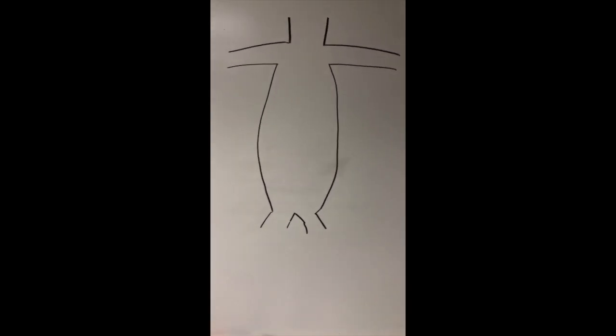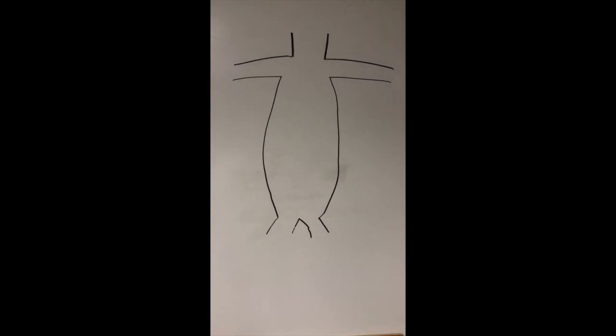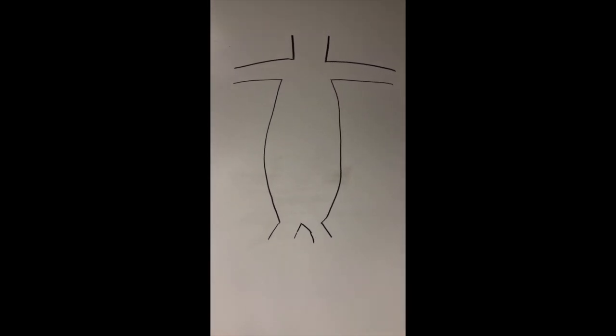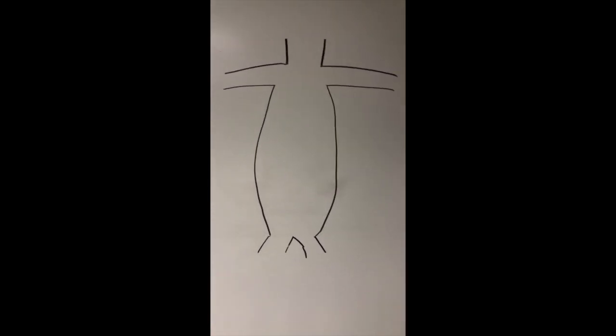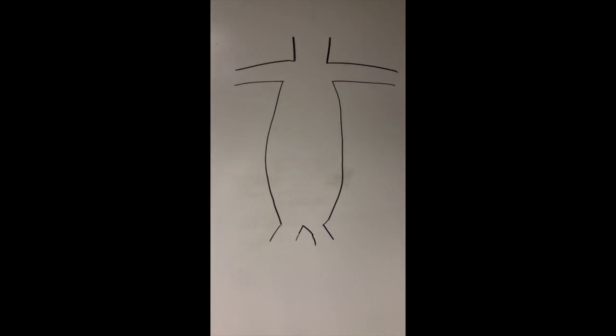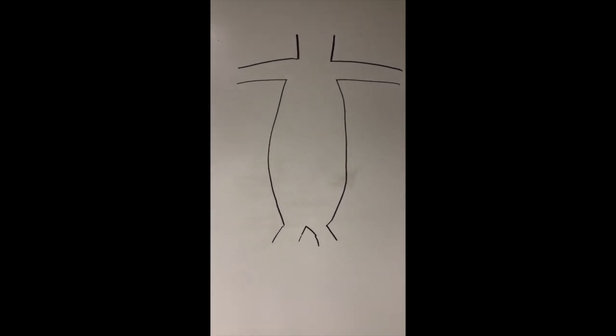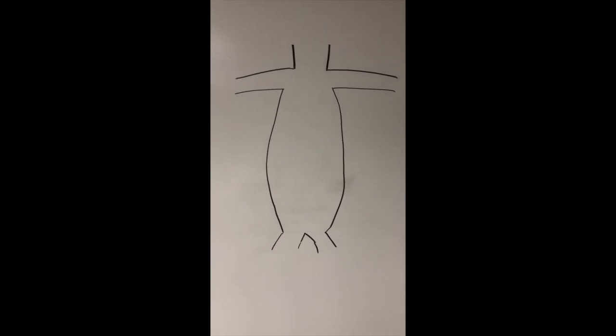So here I thought I'd give you guys the best sort of crash course I could for the whole venous system in the mink. And I think honestly the best way to approach it before diving into the mink itself is just to make sure you have a really solid fundamental understanding of the vessels we need to identify and the landmarks that are associated with them. So I would encourage you guys to use this as a starting point.